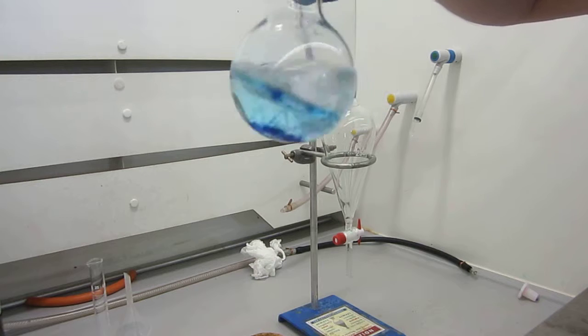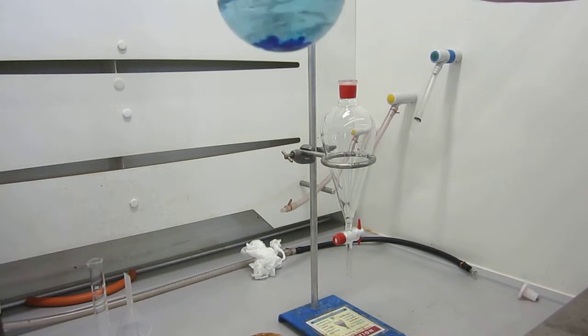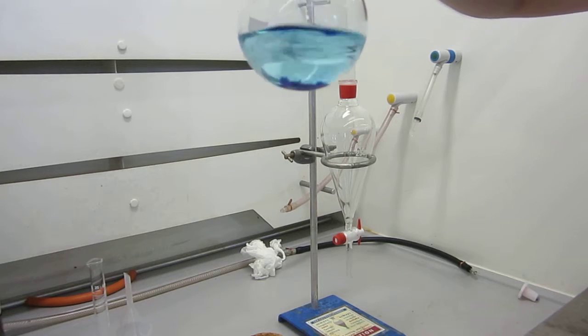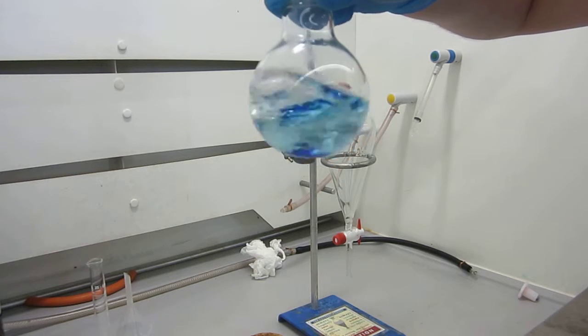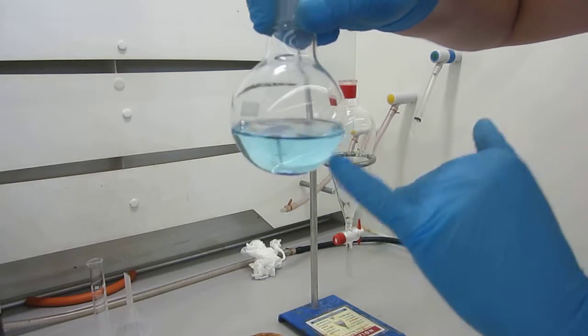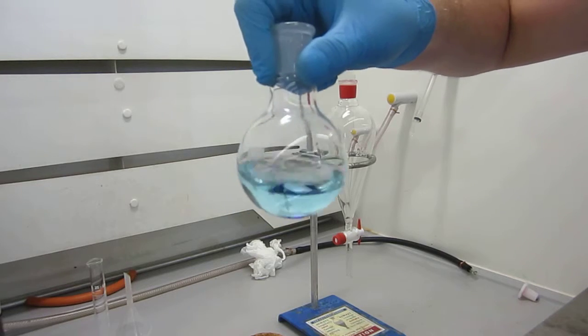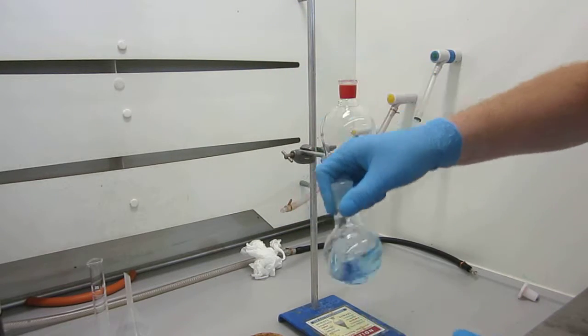So you can see the reaction mix. We've got a lot of the product at the bottom, which is water-soluble, so it doesn't really want to become mixed with the ethyl acetate at this point. And we've got the ethyl acetate as the bulk of the liquid, which has a slight blue coloration in it, where some of the product has dissolved into the ethyl acetate.